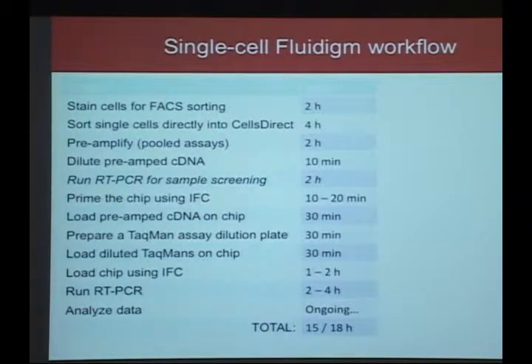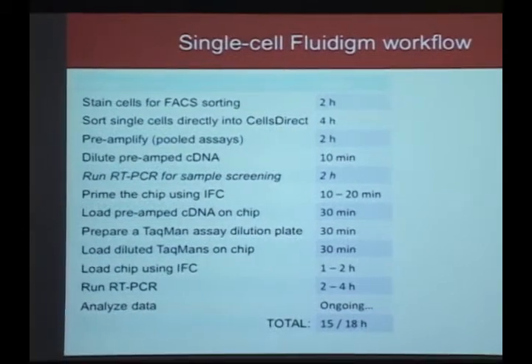How do you make sure that the cycling conditions are equal for each well? Well, to some extent, they're all in very close proximity on this chip. The instrument is built to cycle them all exactly together. I haven't seen any kind of plate effects or edge effects within that small center of the chip where all the reactions are.